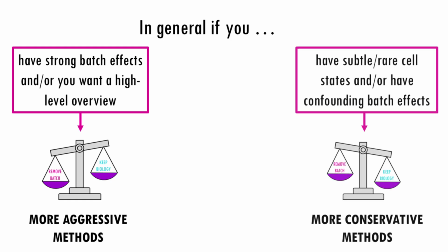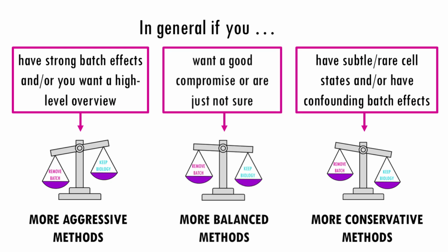And if you're dealing with subtle cell states or rare populations or developmental trajectories, or even if biological variation might be confounded with batch effects, then you might want a more conservative approach, knowing that some batch effects will remain.